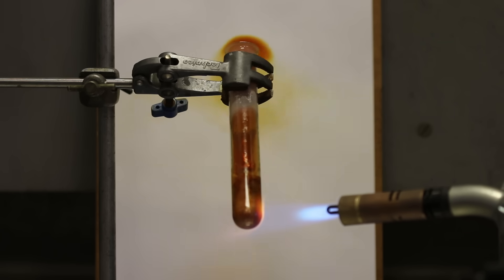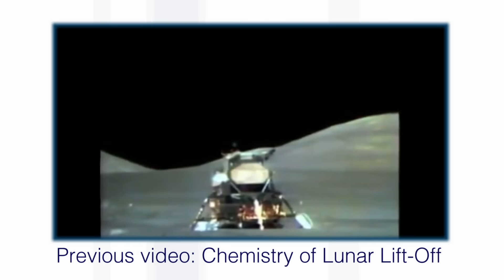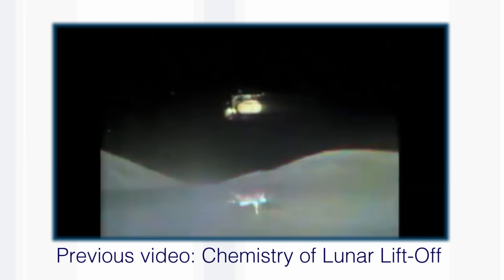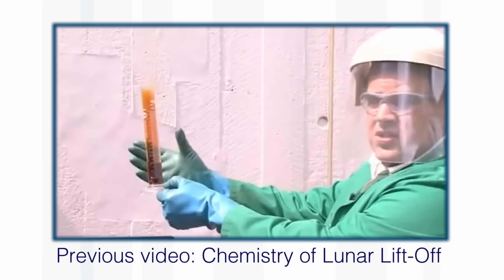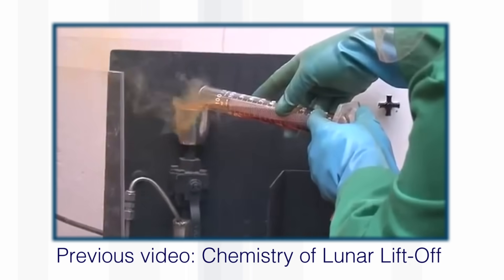NO2 itself can, because it has an unpaired electron, can dimerize. Two of them form N2O4, which is a liquid at room temperature, and we have shown on one of our other videos, can be used as an oxidizer for rockets. For example, the lunar module taking off from the moon used N2O4 as the propellant. Now it's very volatile, it boils at 21 degrees C, so we have to keep it cold, and we put it into the reaction chamber.